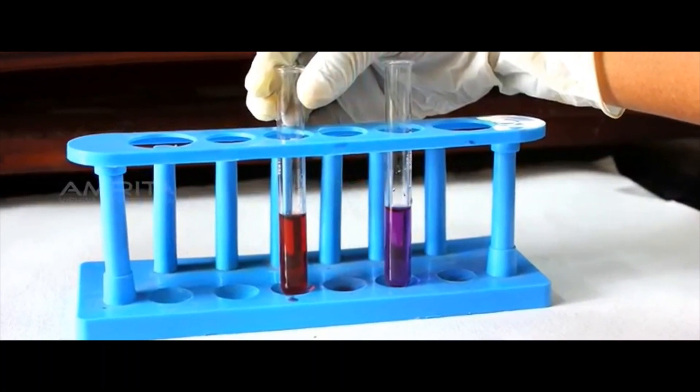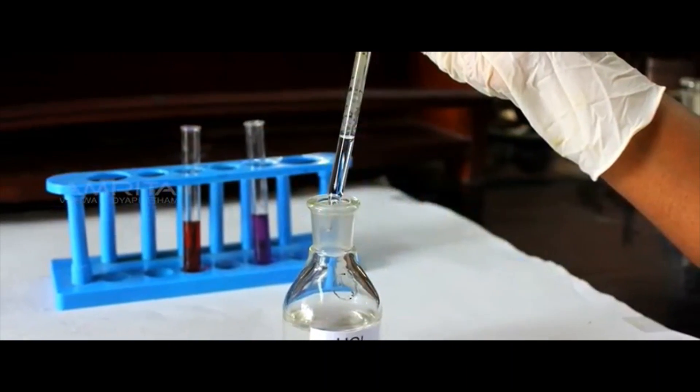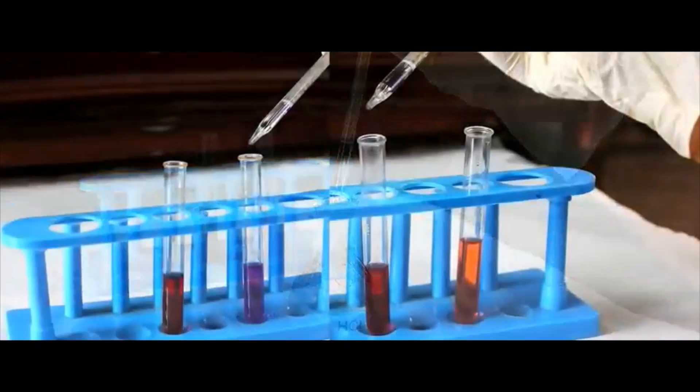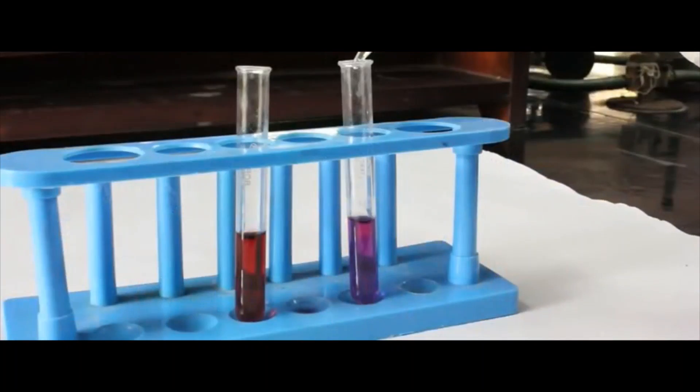Place both test tubes in the test tube stand and add a few drops of HCl in each test tube. You can see that the blue litmus solution changes to red.